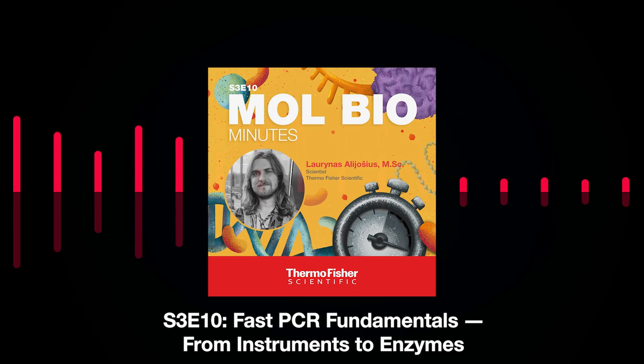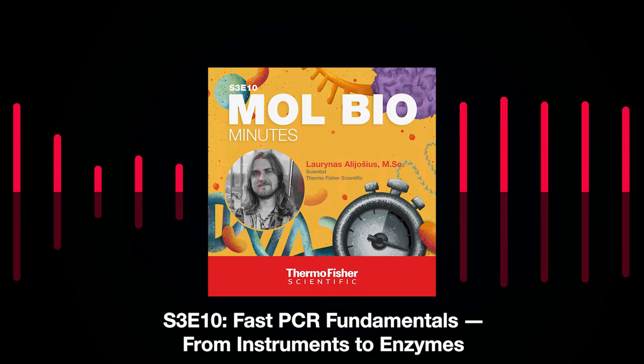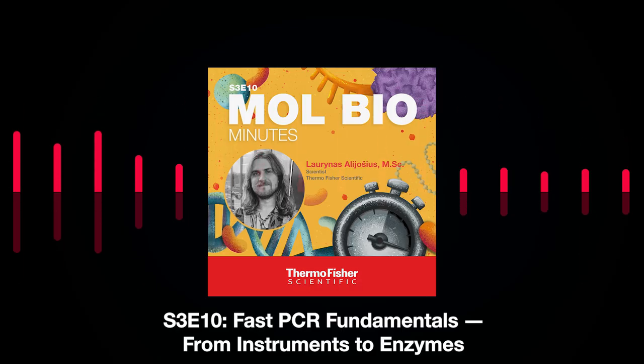However, you can use even longer primers, and that may allow you to run a two-step PCR protocol instead of the standard three-step protocol.